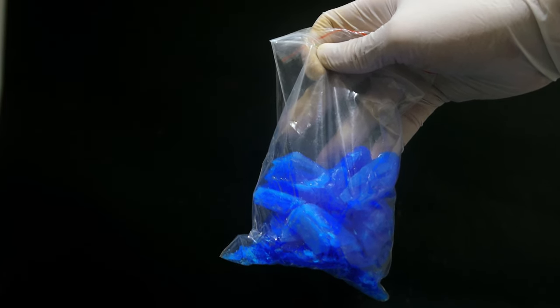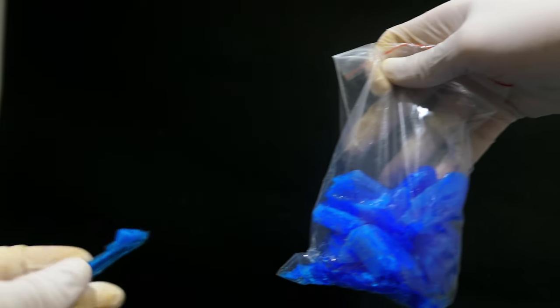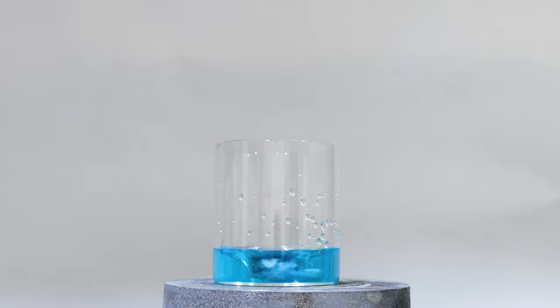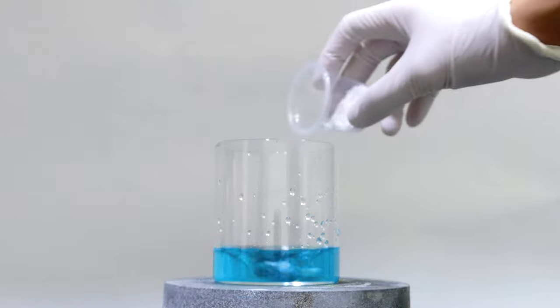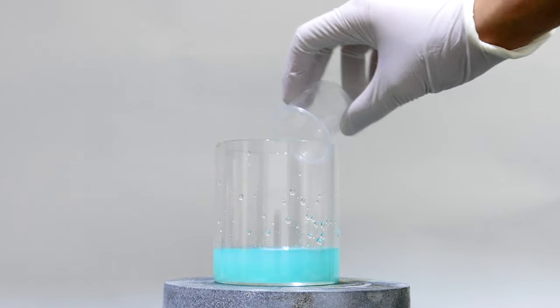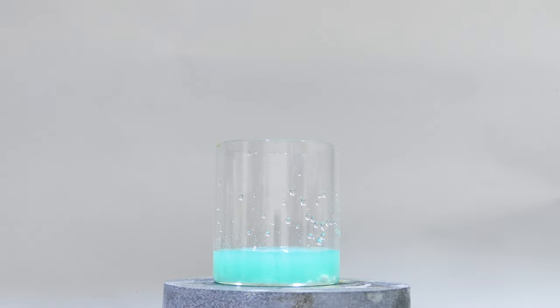First, 1 gram of crystalline copper sulfate pentahydrate is dissolved in about 50ml of water. Then 5 grams of potassium periodate is added. Immediately, the solution turns into light green, and light yellow precipitate starts to form.